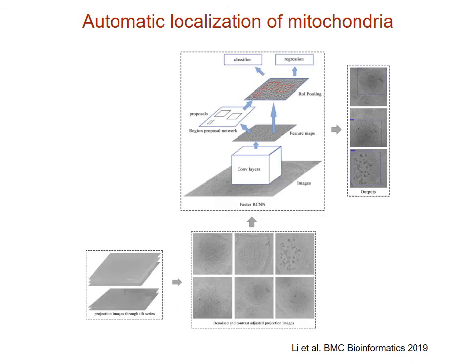The tomograms contain not only macromolecules but also different cellular organelles, such as mitochondria. Therefore, to study the interaction of macromolecules with these organelles, it's also important to automatically localize such organelles in the tomograms.